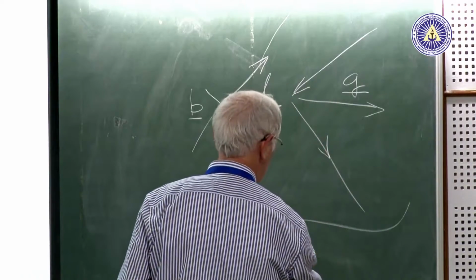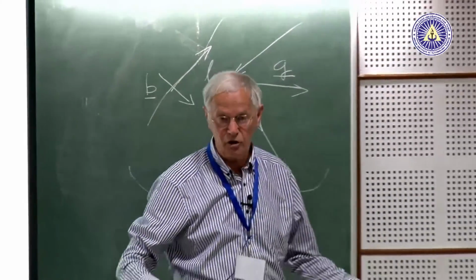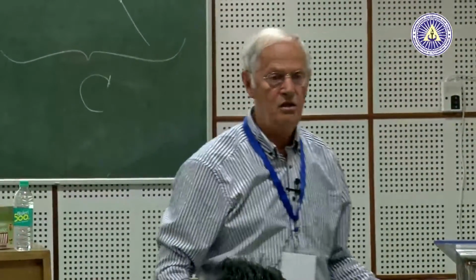And that will result in a number which we can call the contrast factor, which is so well known in transmission electron microscopy. If you tilt your specimen, then a dislocation contrast can become strong or can disappear, and you can use this effect for Burgers vector analysis in a TEM.